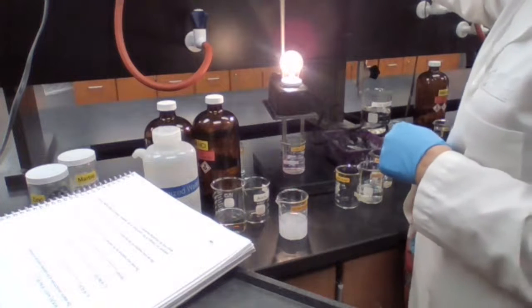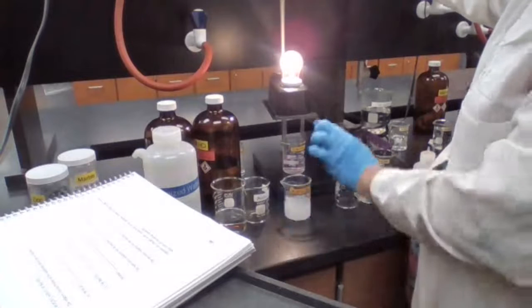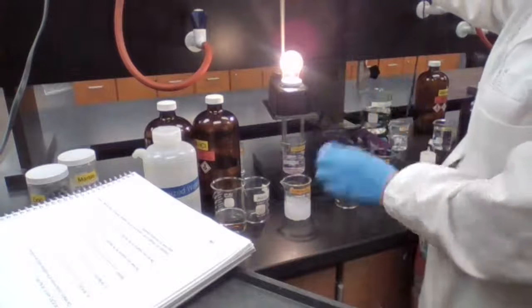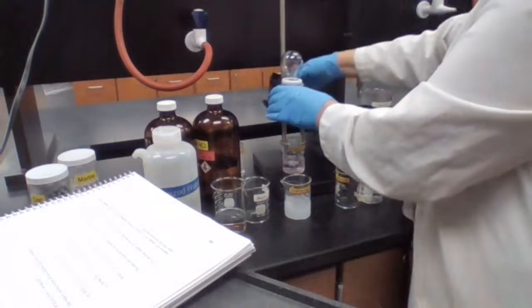The question is, what happens if you make barium hydroxide react with sulfuric acid? So we are going to try that now.